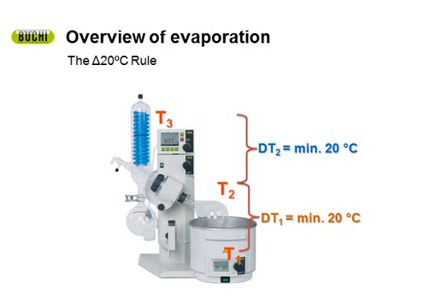So that's the overall Delta 20 degrees Celsius rule. Again, make sure you always follow that when you're performing an overall distillation process.